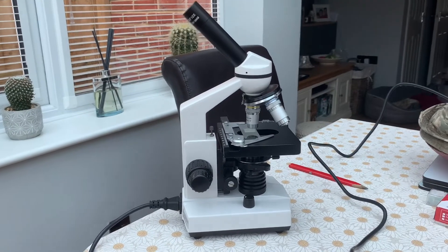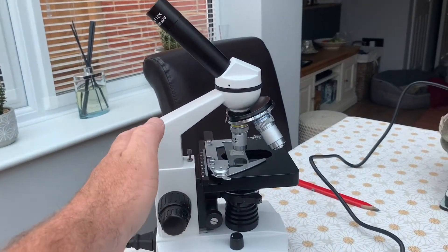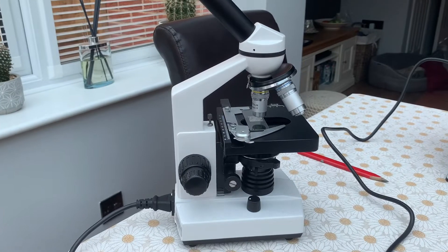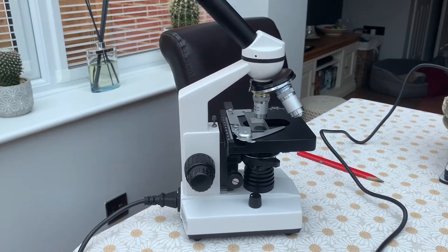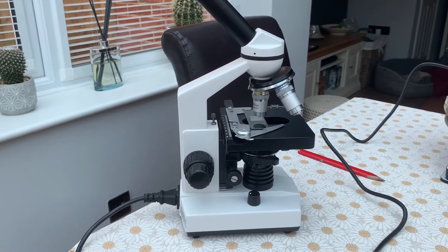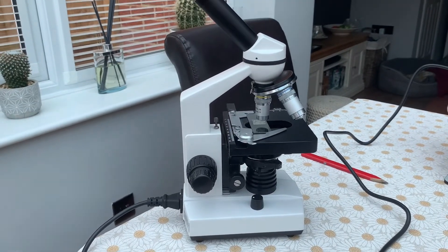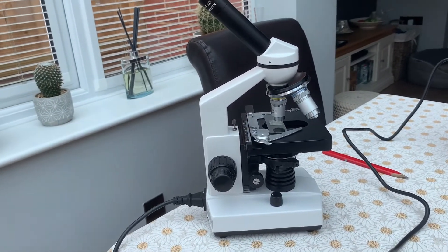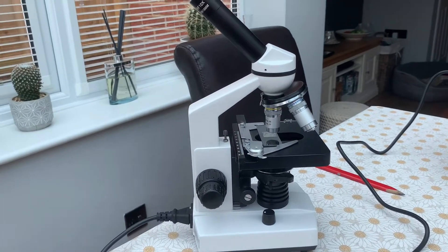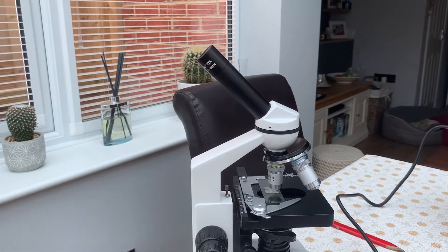So what to look for when buying a microscope? Well, first off, the construction — the actual casing that holds everything together. It should ideally be a nice sturdy metal construction. The cheaper plastic ones might work, but they can get thrown about sometimes, so it's better to have a nice sturdy metal one.